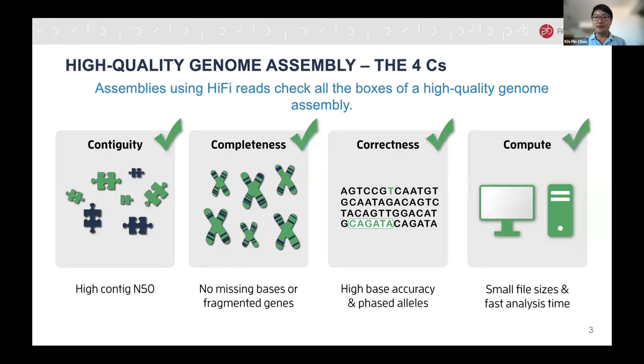But with HiFi assembly, we now also have another C, which is called compute. So altogether, this makes up 4C, and compute refers to the time taken to actually go through the bioinformatics workflow to assemble a genome. In the past, if you wanted to assemble a large genome, it might take days or weeks or even months. Now with HiFi genome assembly, it actually takes hours to assemble a genome.